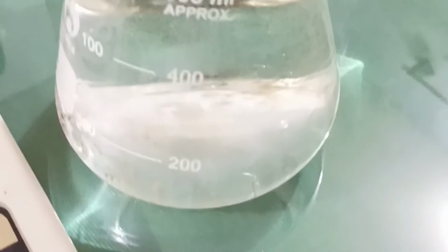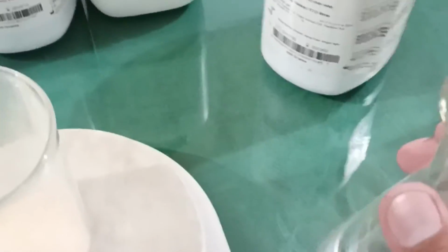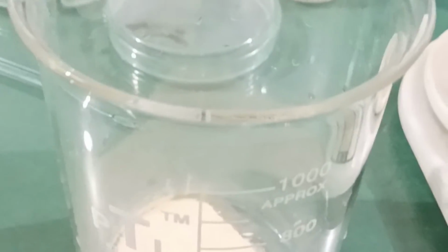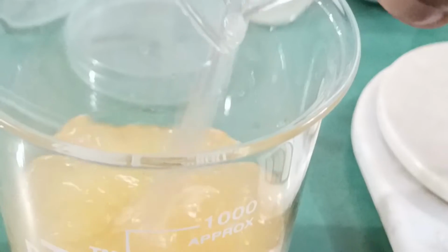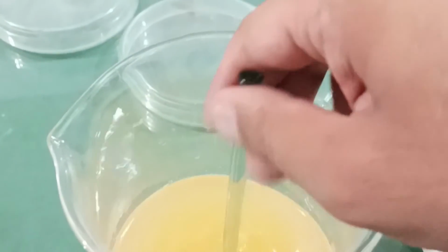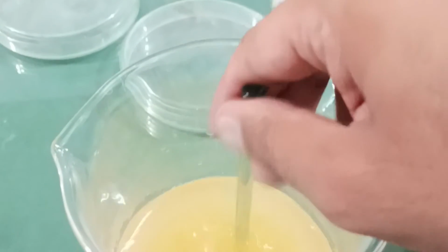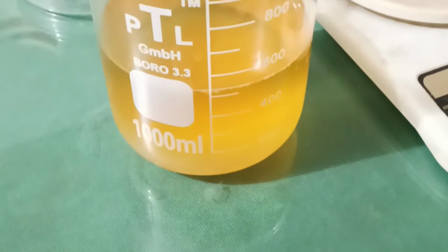Now I will take 500 ml of the distilled water. This is 500 ml of distilled water in the conical flask. Now I will pour this distilled water onto the pre-weighed 14 grams of nutrient agar. Stir it. This media will be stirred using a glass stirrer. After proper stirring, the media was boiled on the gas burner.